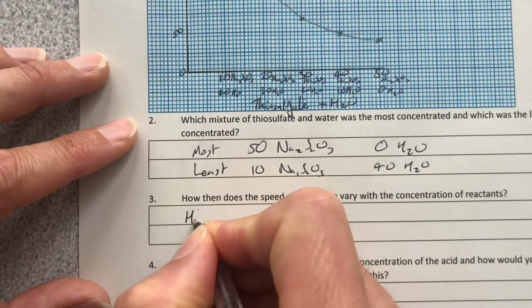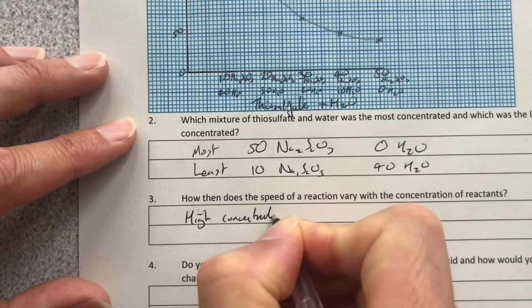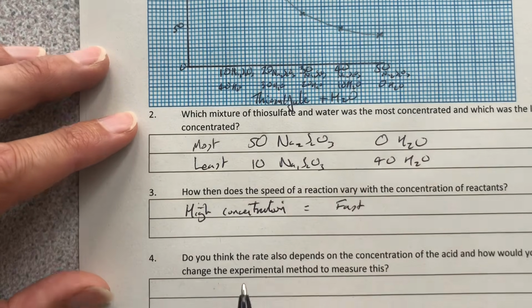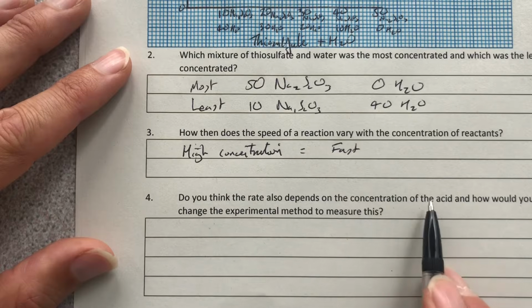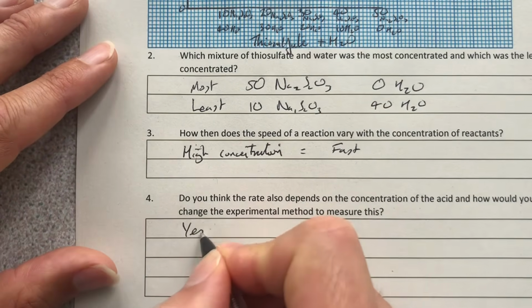How does the speed of reaction vary with concentration of reactants? Well, high concentration equals fast reaction. Do you think the rate also depends on the concentration of the acid? The answer is yes, absolutely it will.